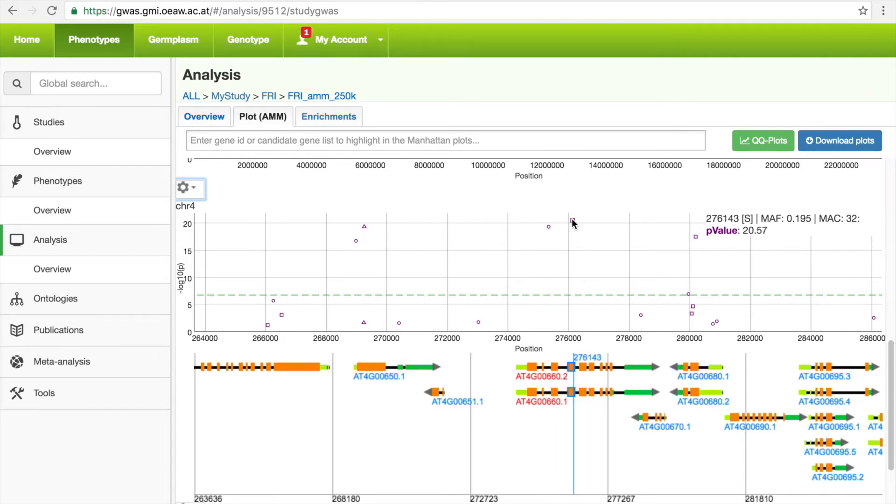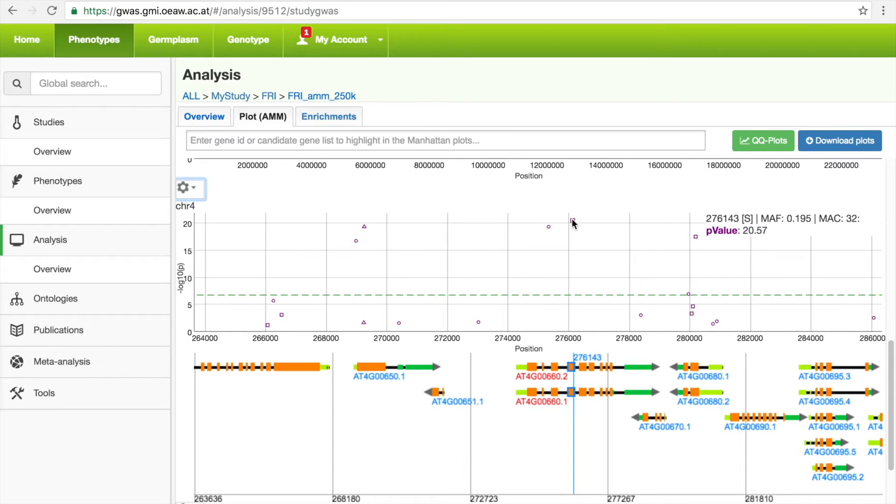Unfortunately, we're not done. Often, these peaks are quite broad with complex underlying genetic architecture. Here, for example, we would like to know which of the 5 SNPs located above the multiple testing threshold is actually the causative SNP.